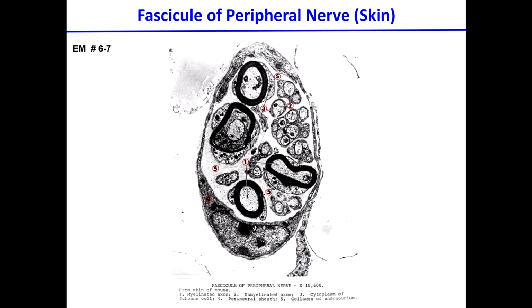This is one of those places in the peripheral nervous system that is arriving into the skin, and the axons are arranged into the so-called fascicles, and it is simply indicating to you that there are certain myelinated axons. There are some unmyelinated axons, very clearly distinguishable here. These ones that do not have this thick structure do not have myelin, okay?